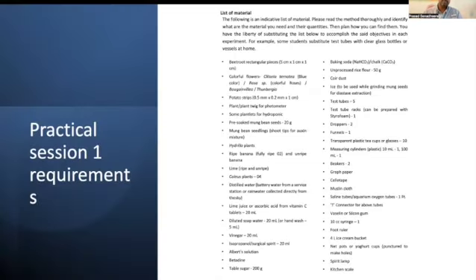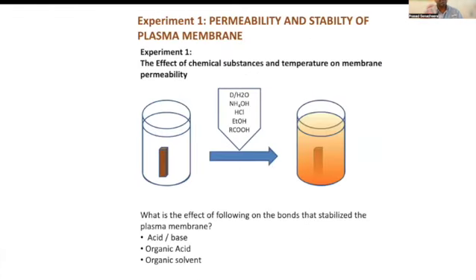To devise this OARP method, in fact, we had a lot of work to do. We had to identify the practicals which can be done at home, and not only that, we couldn't supply any material from our labs. We had to suggest alternatives, even for the chemicals and the materials, that are available in their homes. Now we will see how we have done it in the lab.